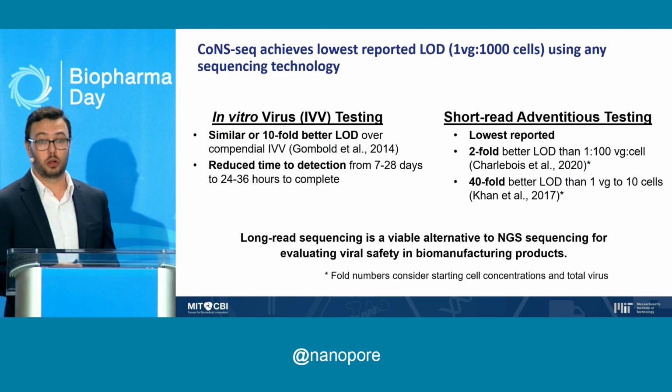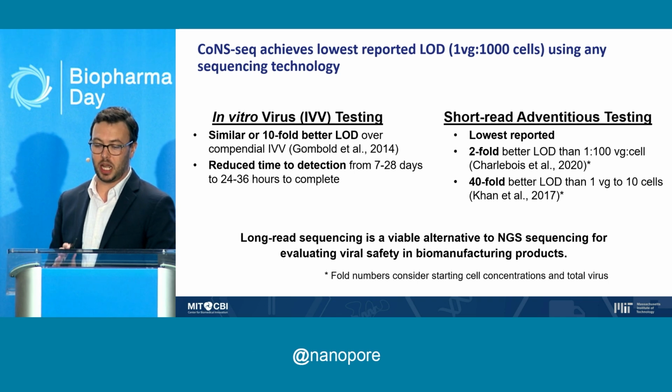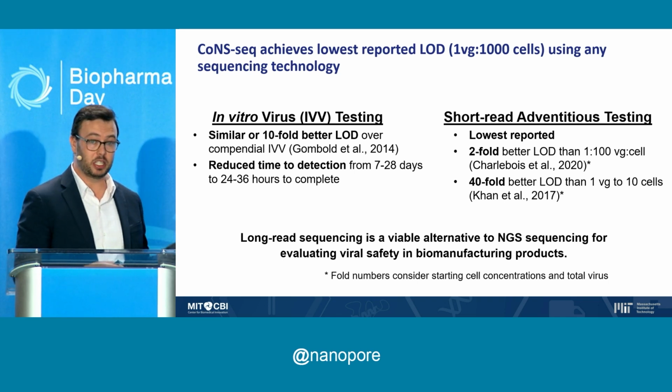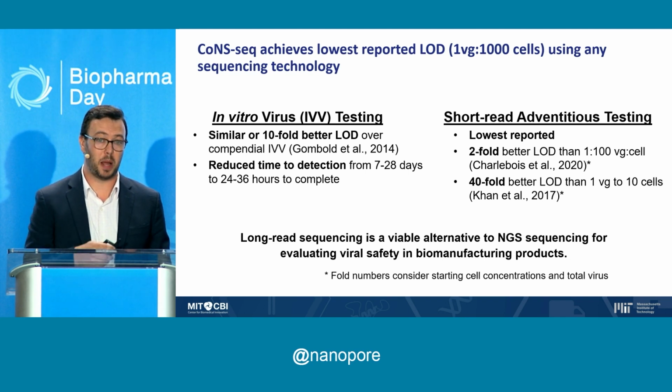Okay, so with this pipeline, we think this is the lowest reported LOD as far as I'm aware using any sequencing technology to date. If you compare this to the in vitro virus assay that's currently being used, we are at a similar to 10-fold better LOD over the compendial assay for these particular viruses. And we've reduced the time to detection, which is really critical, from 7 to 28 days to 24 to 36 hours.